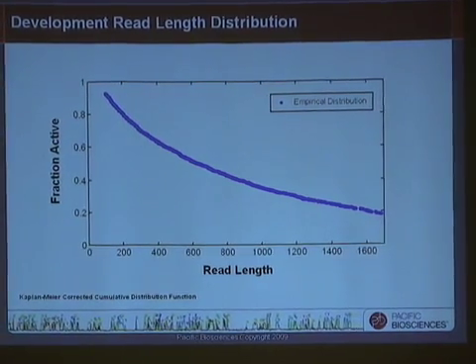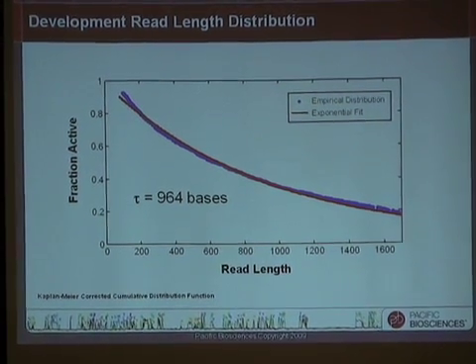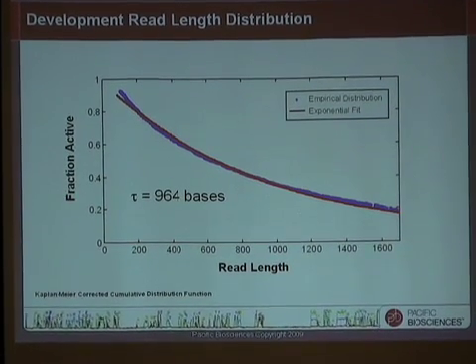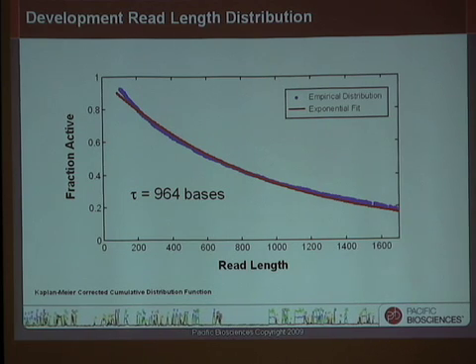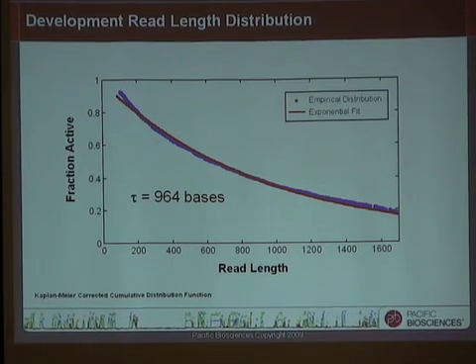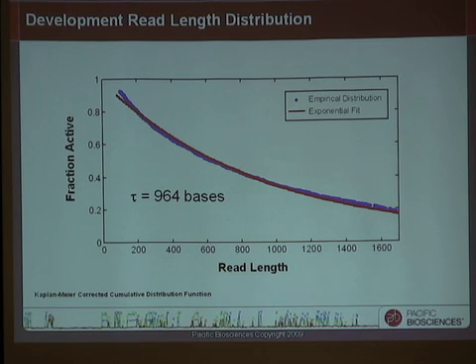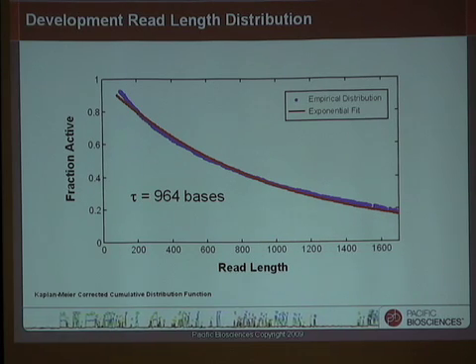So the read length distribution that makes that possible, this I mentioned before that we had an average of 600 with reads as long as 3,000, comes from the fact that the underlying read length distribution is an exponential. All of the processes that end reads in molecular sequencing tend to be single-step dependent processes that produce exponential distributions. And you can see here, this fits very closely to a single exponential. Slight deviations there and there, but you can see very dominantly a single exponential distribution. And the decay constant, that corresponds to the average read length in our development sequencing system, is just shy of 1,000 bases. So in November we exceeded 454 sequencing performance. In January, we exceeded Sanger sequencing read length. And we are now in excess of any sequencing technology in terms of read length.